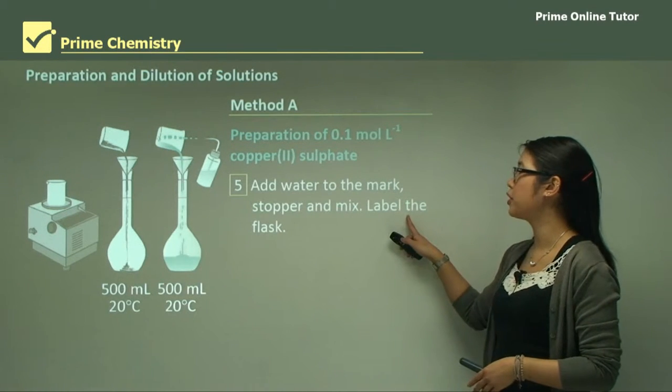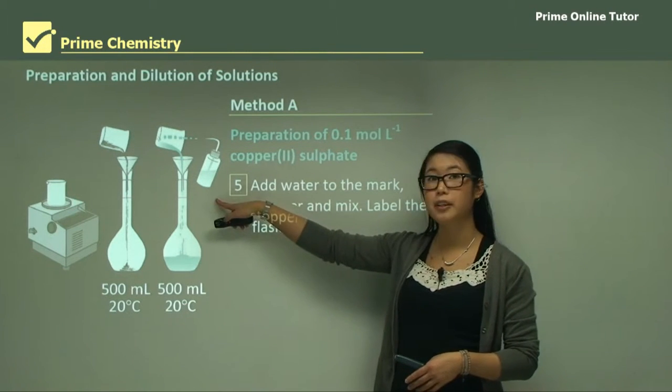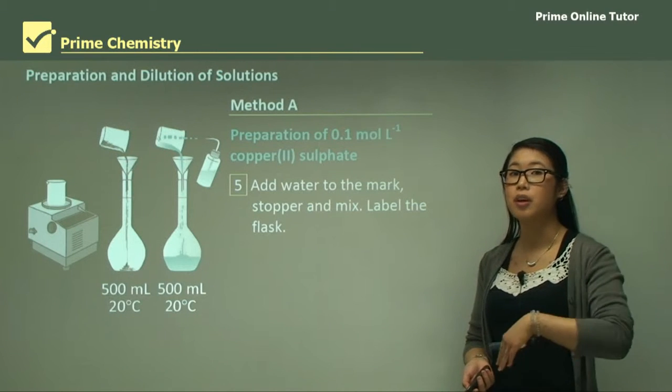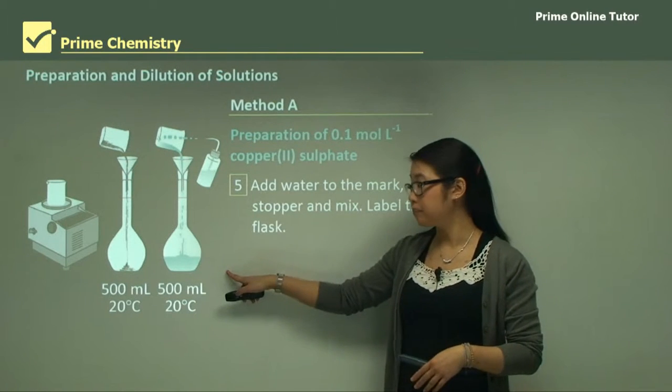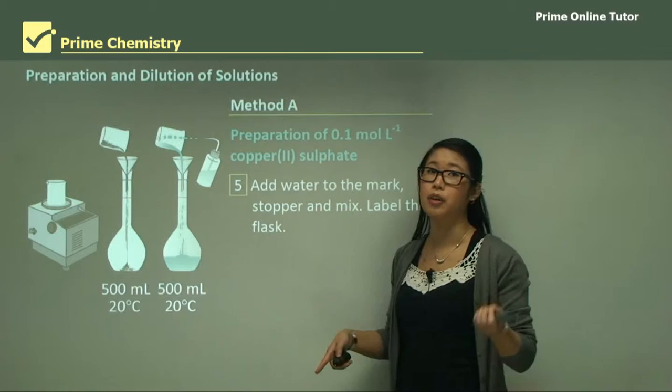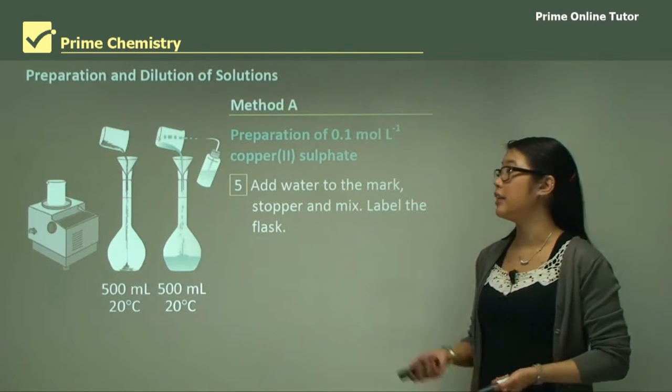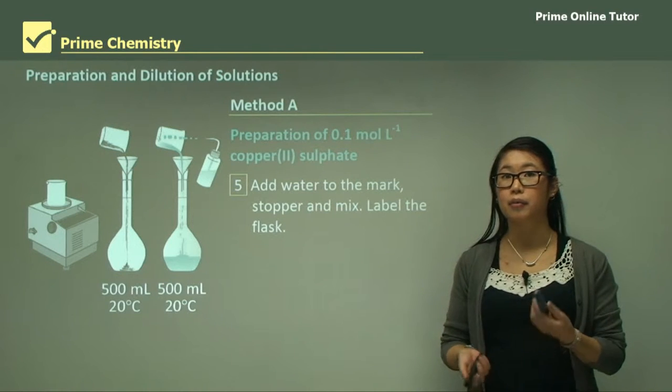We add water to the mark on the volumetric flask and put the stopper in, so we can mix it and make sure it's a homogeneous solution — things are not clumping at the bottom or anything like that. Then we label the flask, and this is the first concentration.